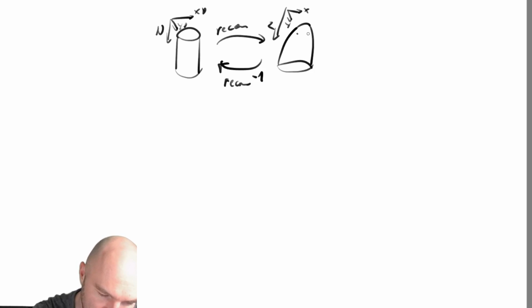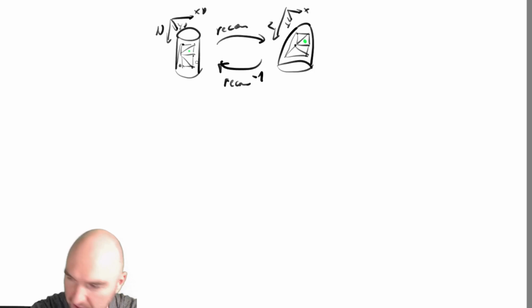So just imagine I'm taking these 6 coordinates here, which would be in detector space maybe here, and I'll create one of those triangular meshes between them. And topologically, I did that wrong. I can have the same mesh by using the same faces and vertices. This should actually sit a bit further out here. Same vertices between here and here. So if I have a coordinate that I only know is somewhere here, I could go and look up where it is here. And that's actually the same trick you've probably heard of people having on Instagram, having their photos photoshopped. It's actually the same transformation that we're using here. It's called a barycentric transformation or barycentric coordinates.